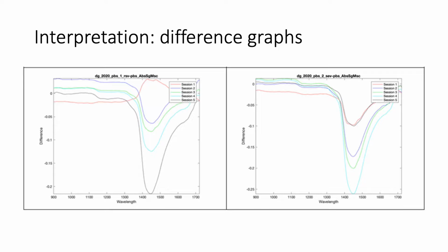The experimental protocol is the machine learning one. We split the data into training and testing sets at a ratio of 3:1 over virus samples. In the training phase, we use tenfold cross-validation to optimize the model. Then we use the optimized model to predict on the testing set.